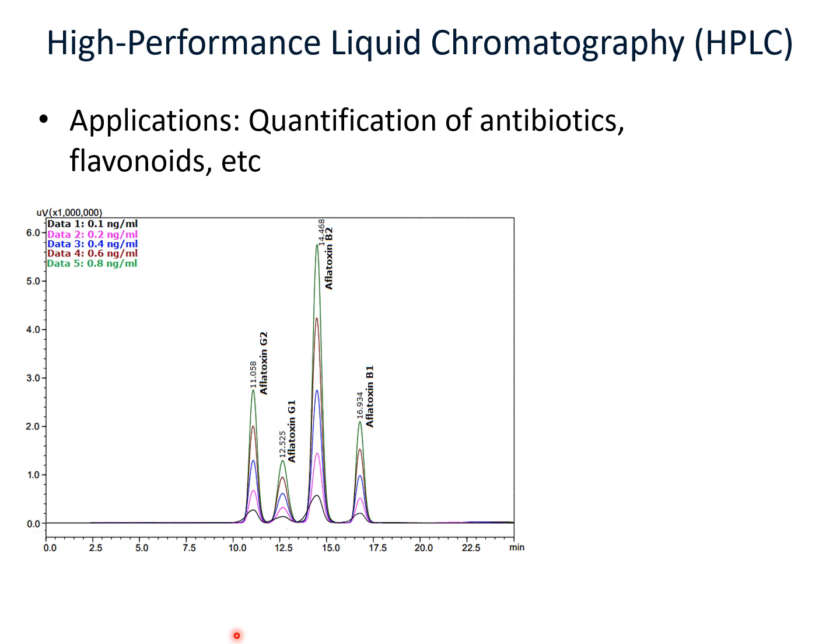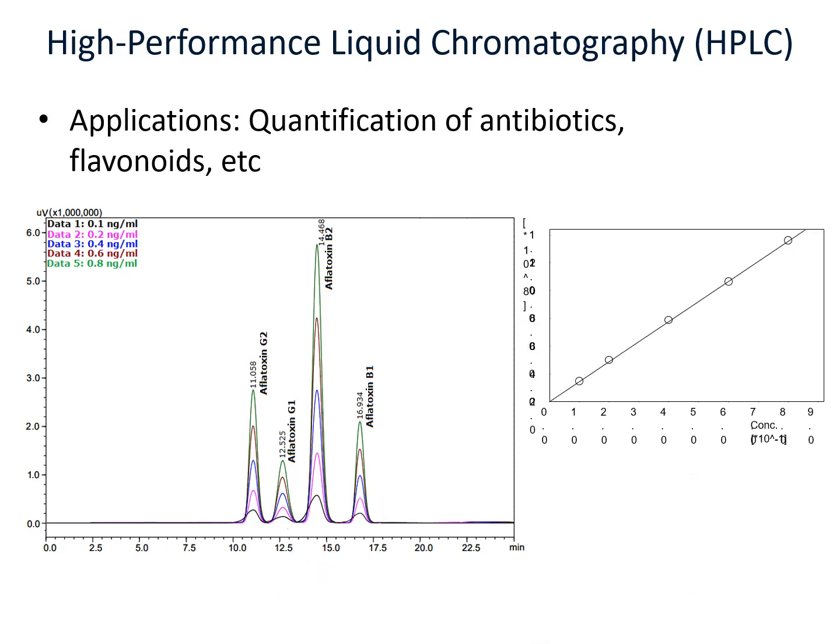And then the peak areas versus concentration will now be used to produce a calibration curve.